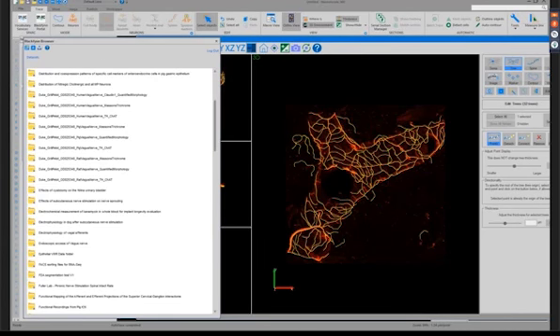Antonina wants to know if it's possible to segment a nerve cross-section image and extract contours or labeled images. The answer is absolutely. There is an automated tool that was demonstrated, but we have a couple of other automated methods as well to outline cross-sections and areas of high contrast, which are normally present with these cross-section images that you're talking about.